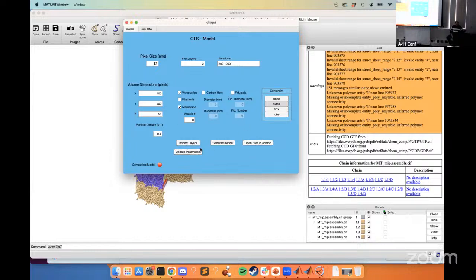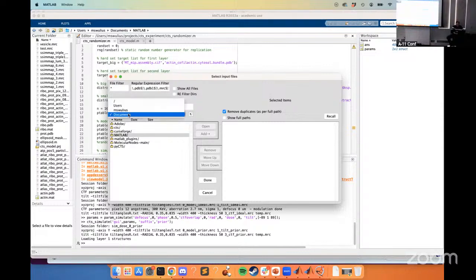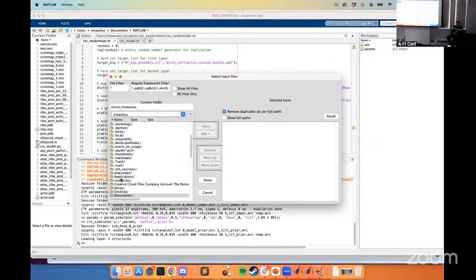But here, let me show you. Usually the size matters only within a limited window, because generally the tomogram is really big. The way the vesicles are generated isn't super realistic, so they really clip outside that area a lot. If you just make it too big, you get these weird membrane walls all over the place.